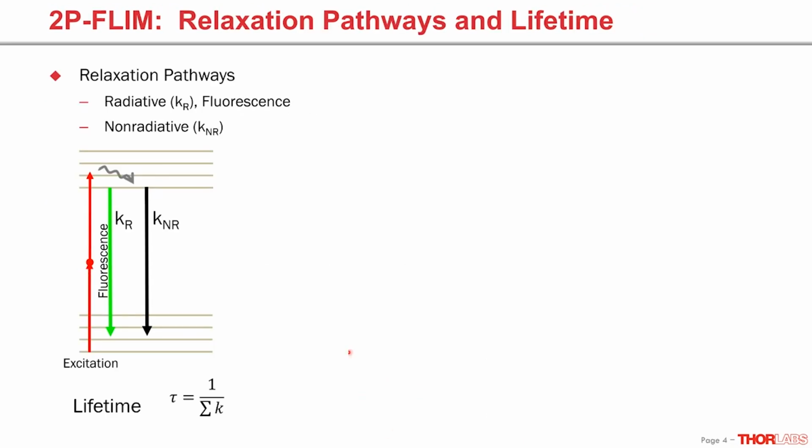So now let's go to the standard energy diagram for multi-photon fluorescence. As we usually see, the red line represents the emitted photon from the laser. In 2-photon excitation, there needs to be 2 photons from the laser very close in time and space to elevate the energy state of a single fluorescence molecule.